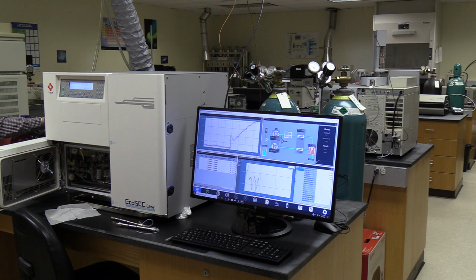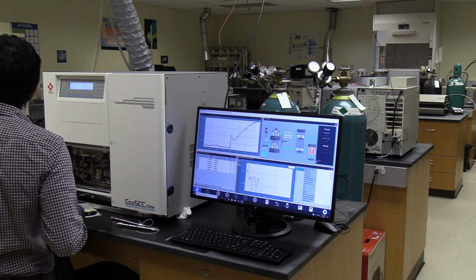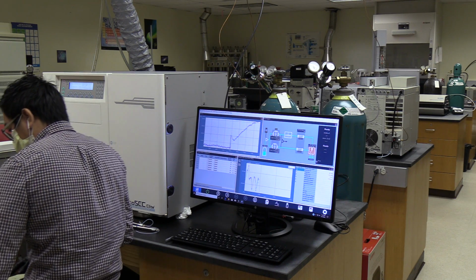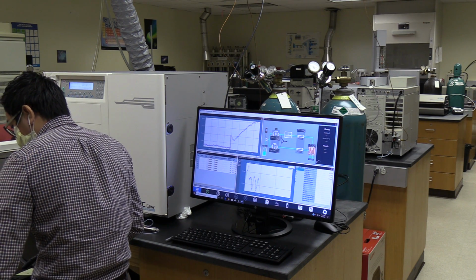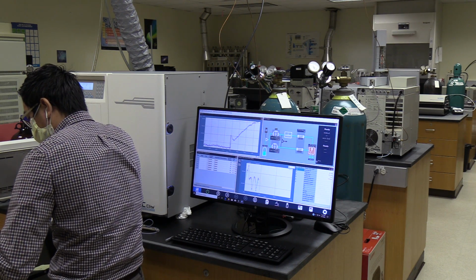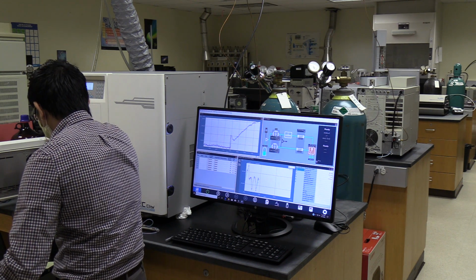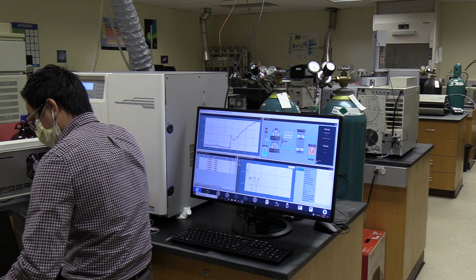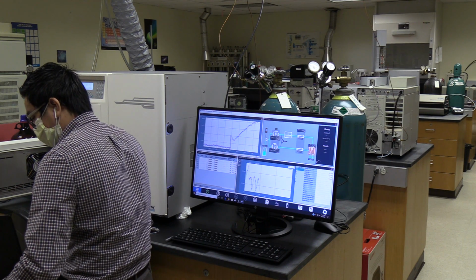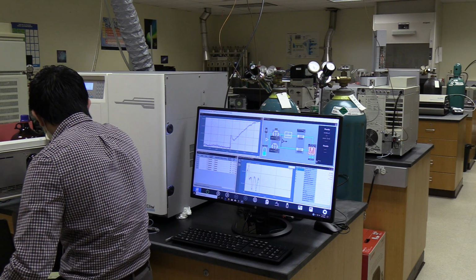What's going to happen here is that it's going to pump solvent from your solvent bottle into the pump of the GPC system. This is going to be the pump of your GPC system. And what you have here is going to be a fan. This is a temperature controlled pump oven, and it also has a moisture detector. The purpose of the moisture detector is to detect moisture if there's a leak. So if you have a leak of a volatile solvent, it's going to detect that.